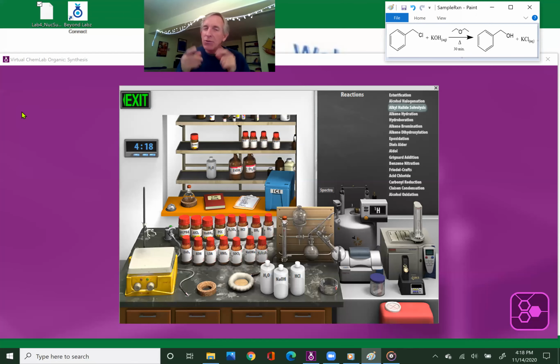And the only way you can prove that to me, don't be liars out there, the only way you can prove it to me is by using IR and mass spec. So let's look at what the Beyond Labs platform has. It has all those instruments over here.